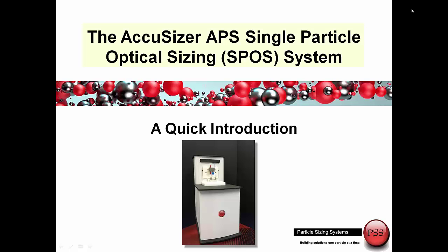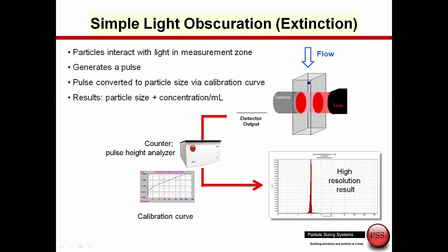Today's presentation is an introduction to the AccuSizer APS single particle optical sizing system. These basic light obscuration sensors have been around for many years, and that's what we're looking at on this slide.